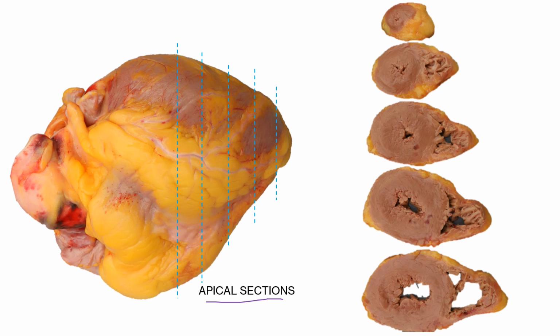So what we see here is that we have the heart on its front surface. What you want to do is line up your cuts indicated by a blue line, and of course we're using our long trim blade with the fibrous skeleton of the valves of the heart, which you can kind of feel. So this is the plane we want to be parallel with when making these sections. And to start out safely, you can leave it in 1 centimeter thickness intervals.